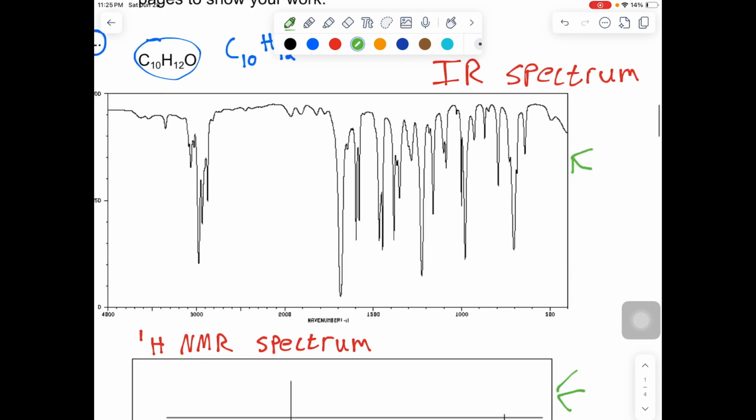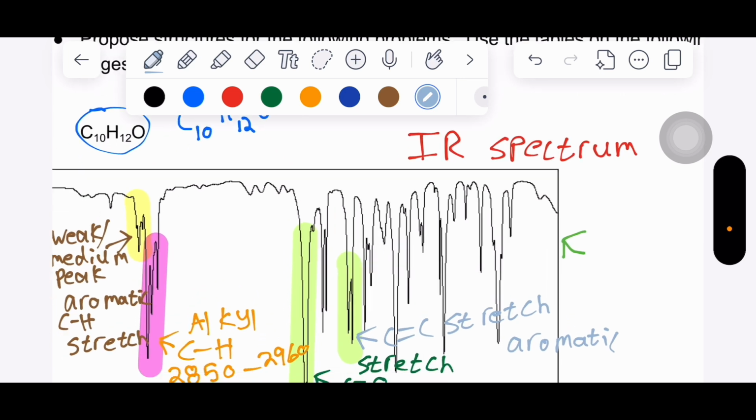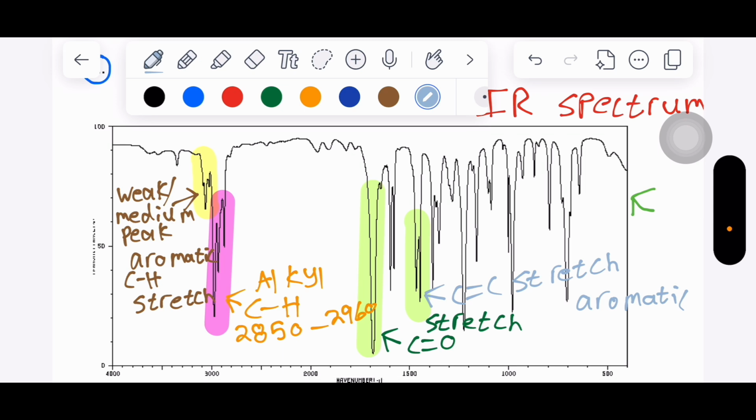And as we move forward, we need to start with the infrared spectrum because I like to analyze that first so we could get an idea of the function. Alright, next thing, I also apologize because I'm using a different device right now. So moving on, for this recording I'll be describing the infrared spectrum.